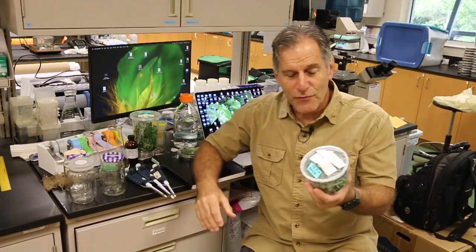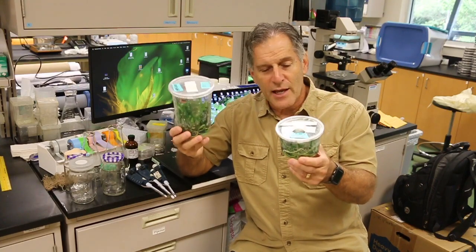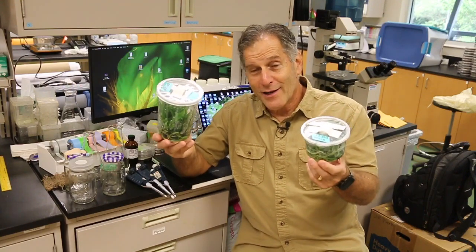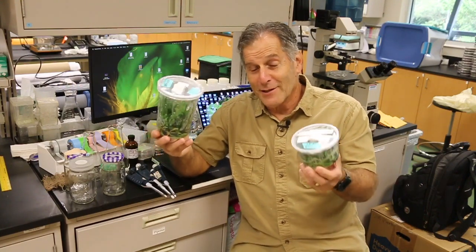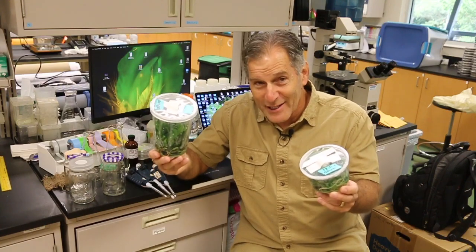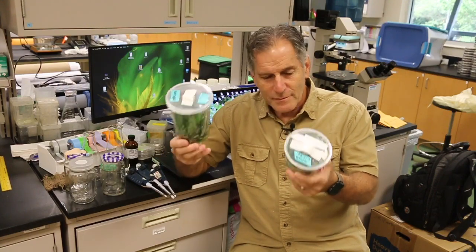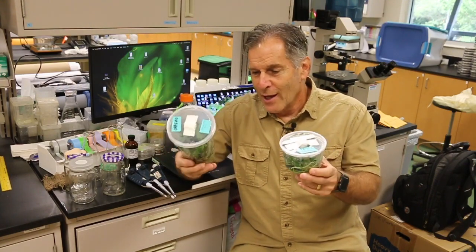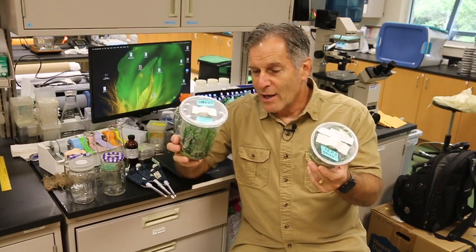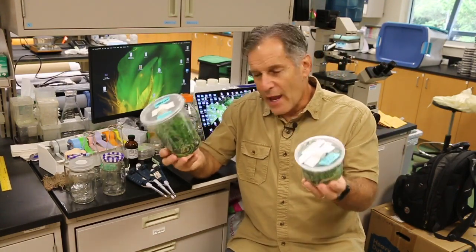What people now use for most flasking purposes is these flasks, and these are large deli containers. No one thought of changing it. Maybe we can start a little campaign to change it from flasking to deliing, even though that's a lot harder to say. But these are just deli containers, 16 and 32 ounce, and I've modified them so that they're vented. I like using these containers because it's really easy to access the contents.